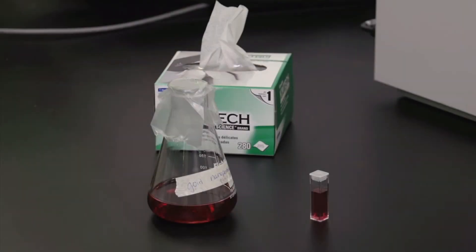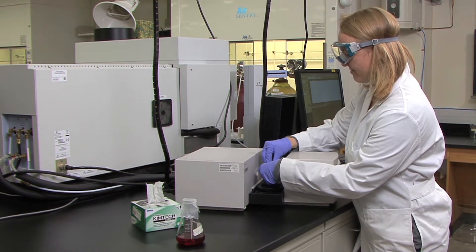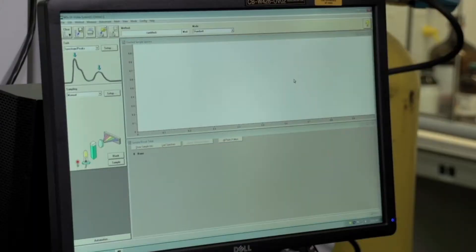Now we're ready to measure the extinction of the synthesized nanoparticles. Fill the cuvette with the nanoparticles about two thirds of the way full and then place that into the sample compartment so we can take a measurement. Now that we're ready to collect the sample, we can do that. Just select the sample button and we will get a spectrum.